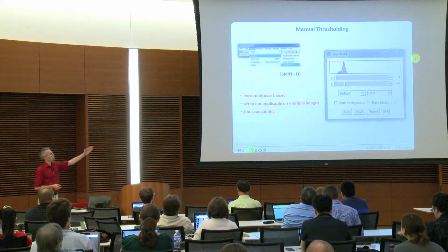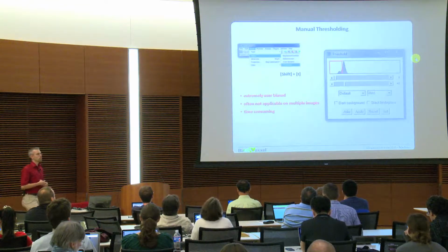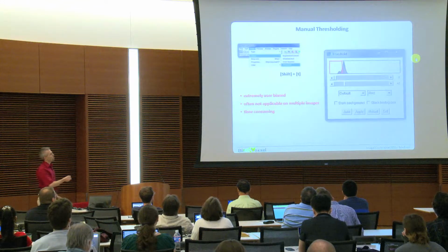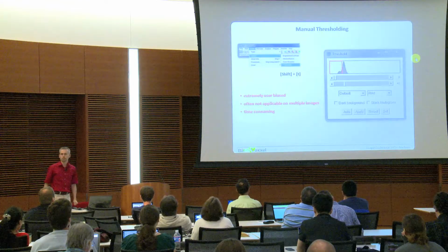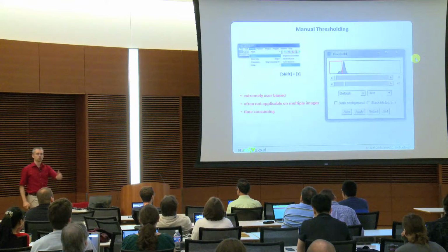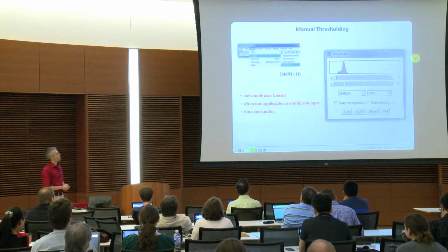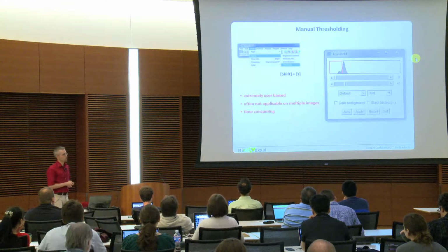Ari has shown that already. We can use the manual thresholds dialog. That is a little bit tedious because first of all you have two sliders for two cutoff values, an upper and a lower one. Then every one of those sliders has 256 possibilities, so you have 2 times 256 possibilities. If you take only one, it's already a lot. And the problem is, where do I set my cutoff value? So the first thing is that it's time consuming and it's very biased.